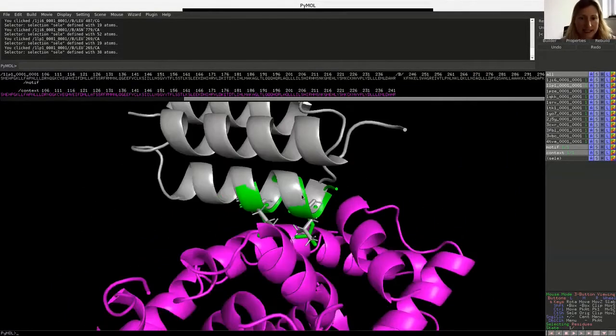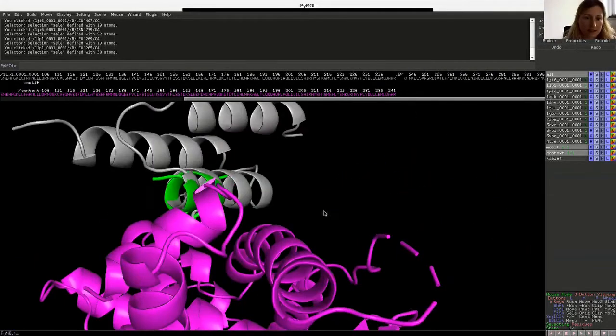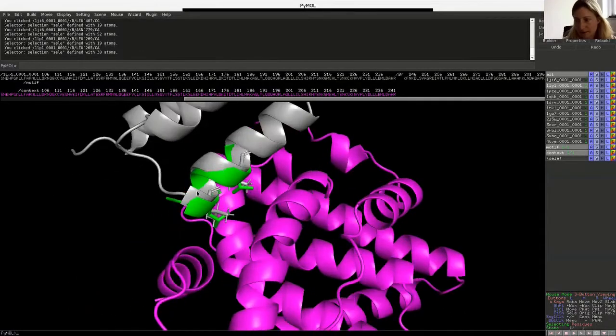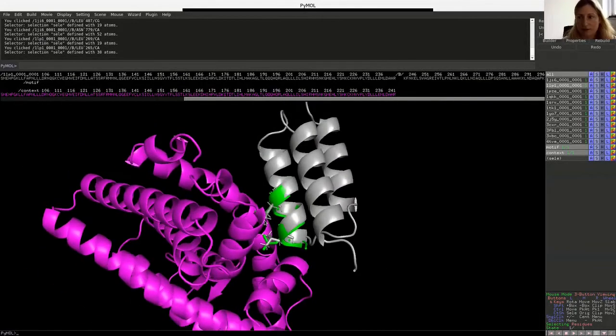And that is the case. So this looks actually super nice. You can even see that this portion really captures it all very well. This looks like a really good sidechain graft. Obviously, there are a lot of things that you need to look at. You have to sample a lot of these designs. And there's something happening.